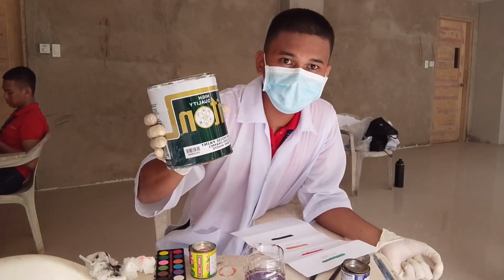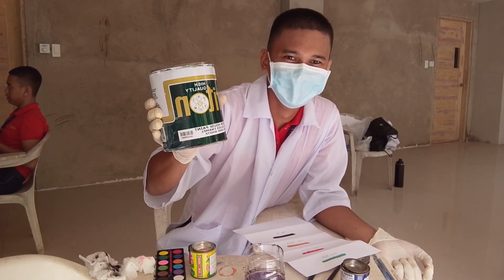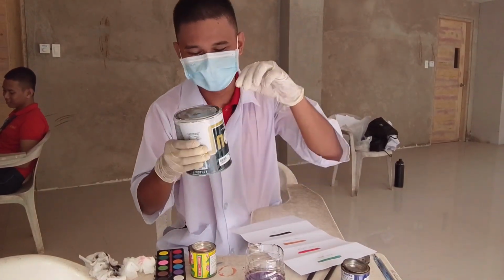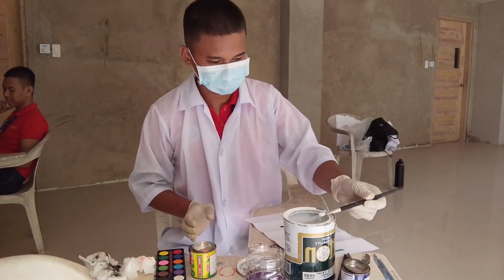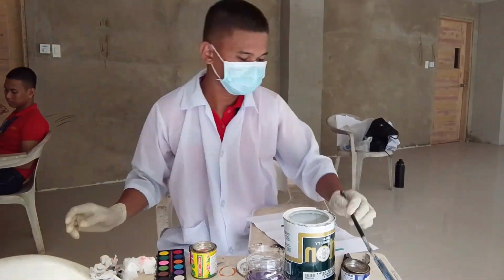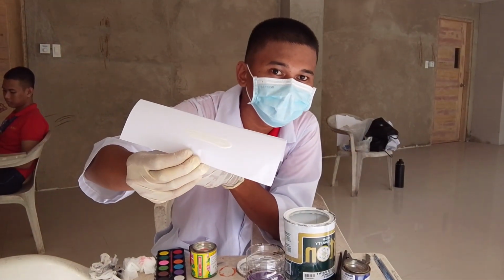Semi-gloss paint is a type of paint that is used for surfaces, doors, and walls. So I'm going to collect a sample of this. I am done collecting the semi-gloss paint.